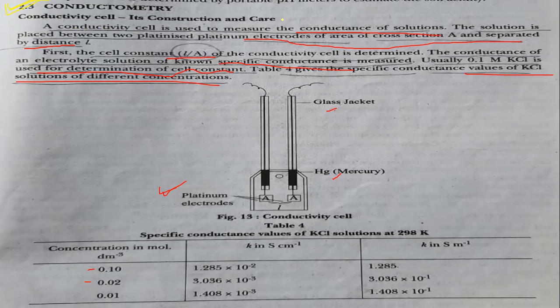A conductivity cell is used to measure the conductance of a solution. Why are we measuring the conductance of a solution? To do the qualitative and quantitative analysis of any substance.